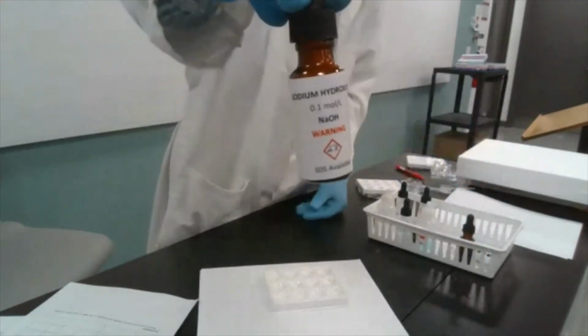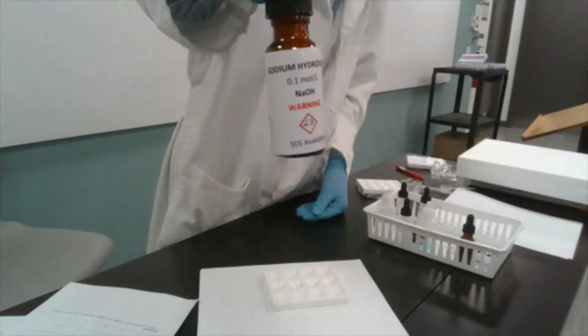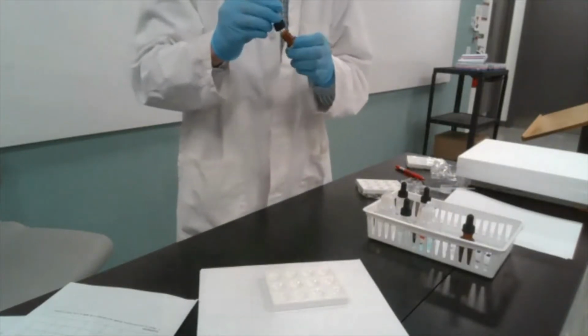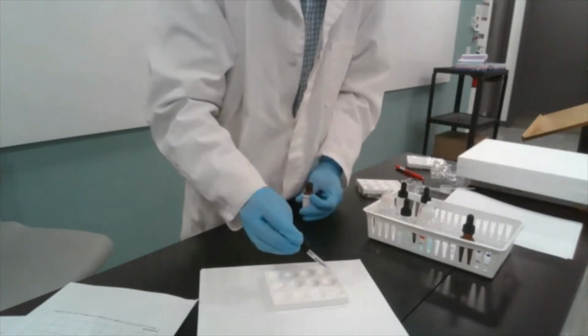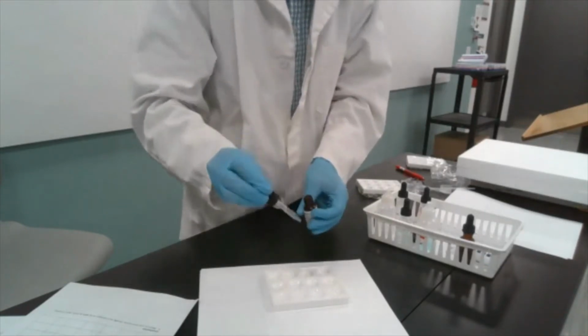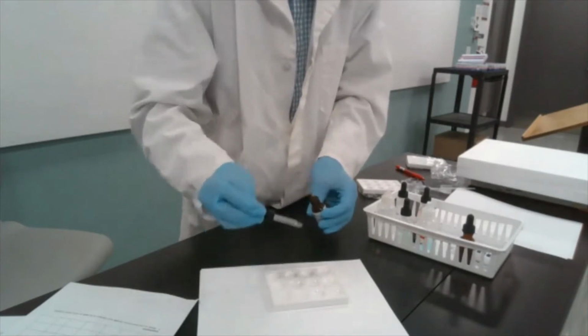Now, sodium hydroxide, we know that it's a base, right? Because it has a warning sign, and the chemical formula probably tells you the same. If I just spoiled your prediction, sorry about that, but I'm sure that by now everyone probably knows what sodium hydroxide is.